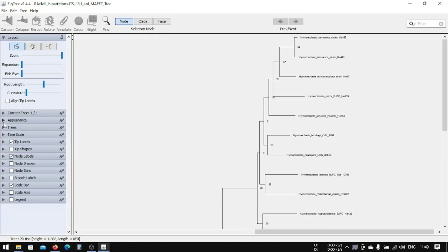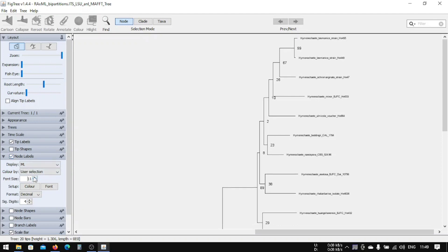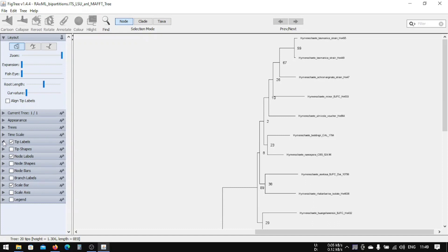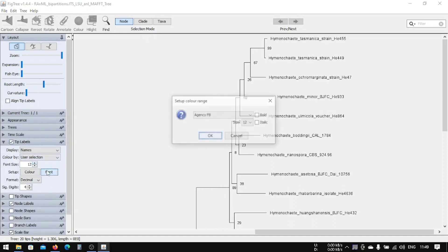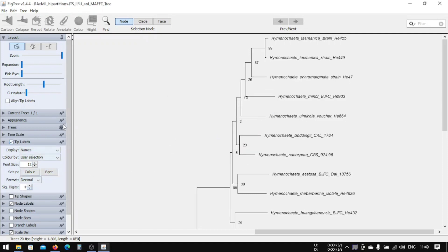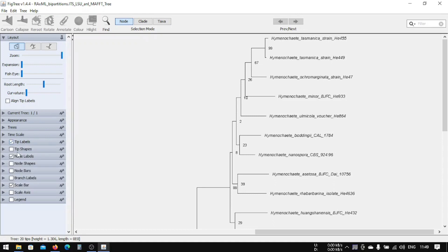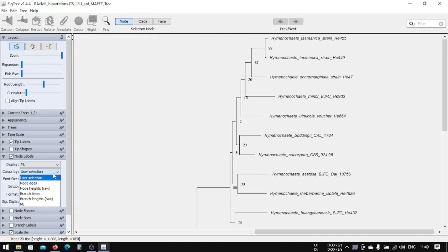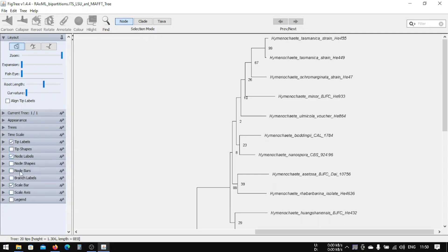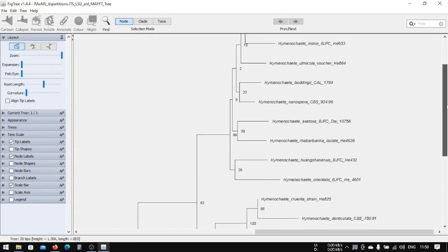To change the appearance, we can increase the node label font size — set it to 11 — and also change the font to Arial or similar. You can change the settings according to your needs, and now you can see the updated tree.